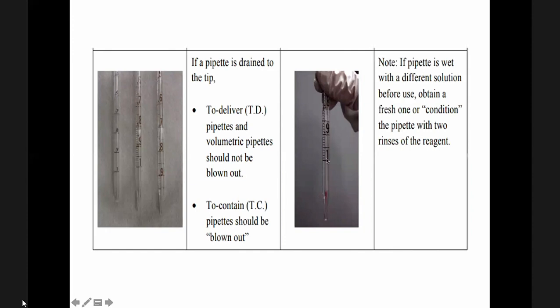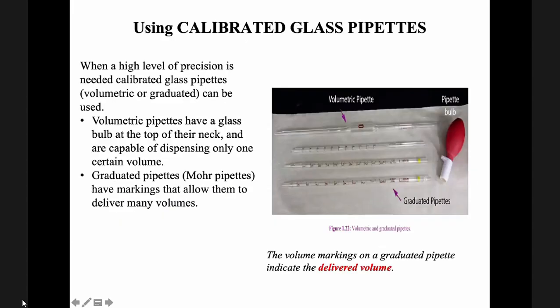So, di ba may marking siya? Dapat i-blow, ganun siya. To contain pipettes should be blown out. To deliver pipettes and volumetric pipettes should not be blown out. So, you know the difference, ha? Okay, so mabalik na tayo.